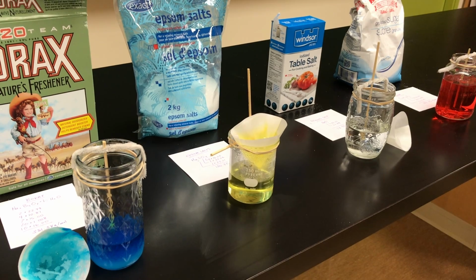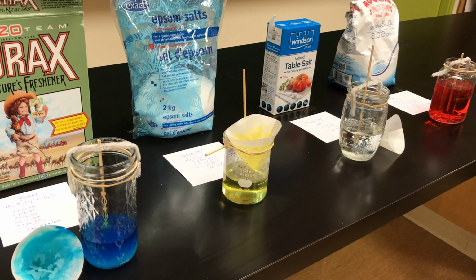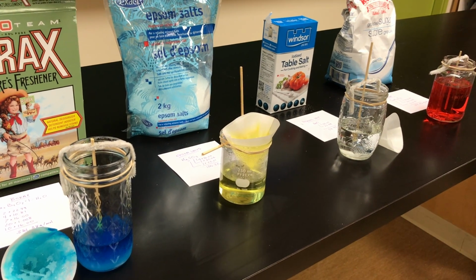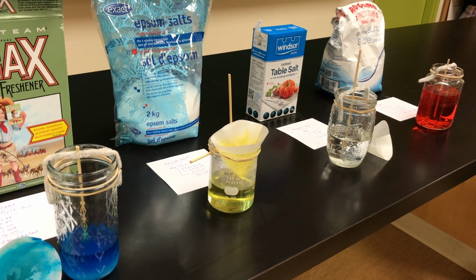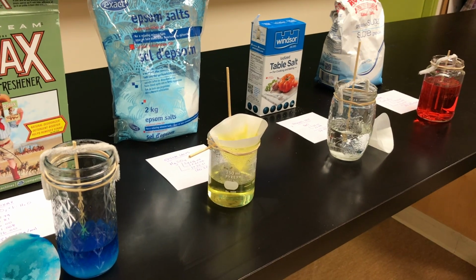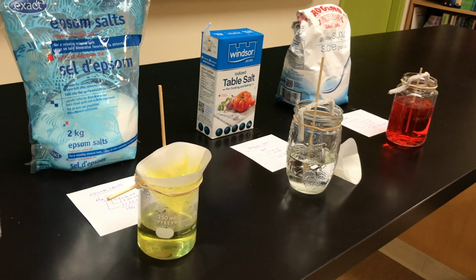Then I transferred that material to the pot and heated it up, adding more solute, making a super saturated solution. I rigged up a bunch of funky ways of straining or filtering that to avoid too many nucleation points across the board. And I'll just give you a quick summary of what I'm finding here after I've just made this.